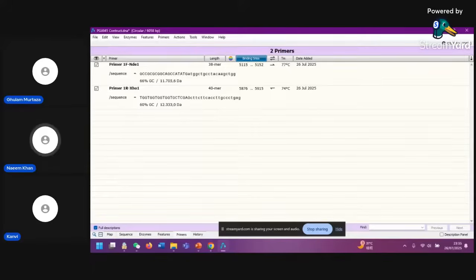So when you are choosing the gene and vector, the vector has a specification. When you go to the website of our vector, or from any search engine, you can search, suppose, pET28a vector. First I should know about this: if my fragment size is 800 base pairs, I must know whether this vector can accommodate this size or not. Some vectors can only take 200 or 300 base pair nucleotides, but they do not express large fragments. So first, size is very important, and second are the features.